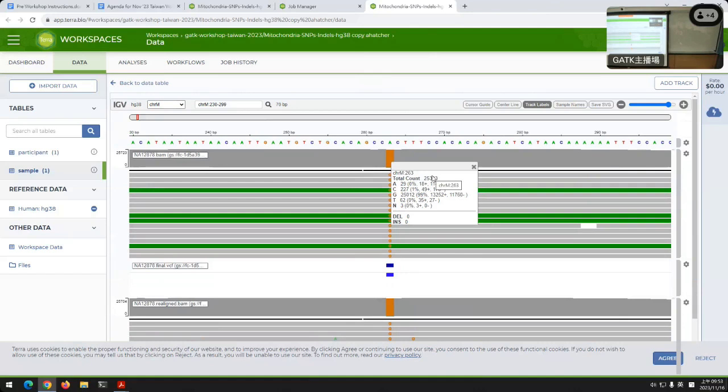Like I said, you get a lot of data. Now, the good thing is, you can actually get pretty solid information on some of these real signals, from subclonal populations, because we have so much data in there, you can get good evidence for them. It's just handling all that data that's the issue, okay? But my point is, you can use IGV to view the data just like you would anything else, all right?